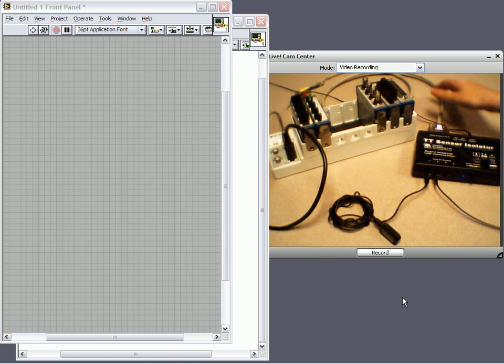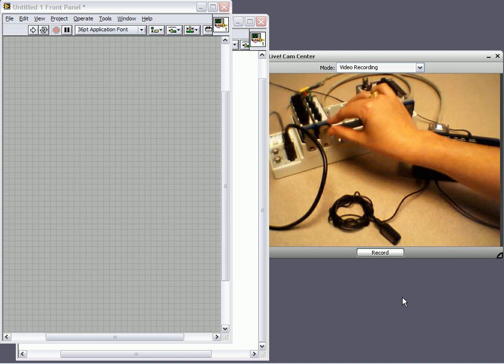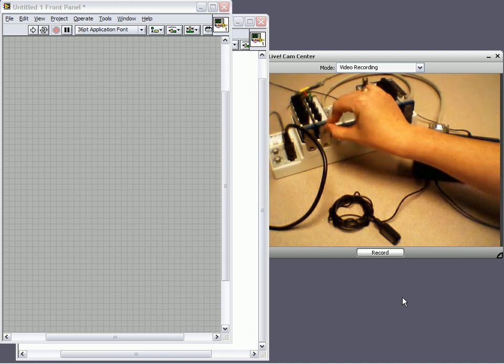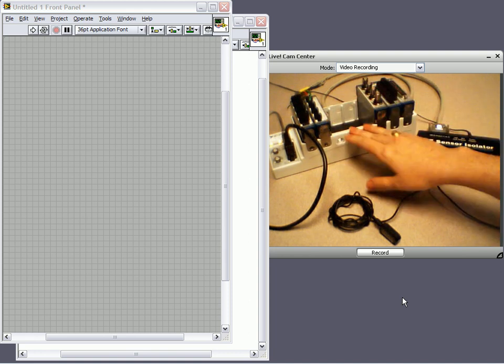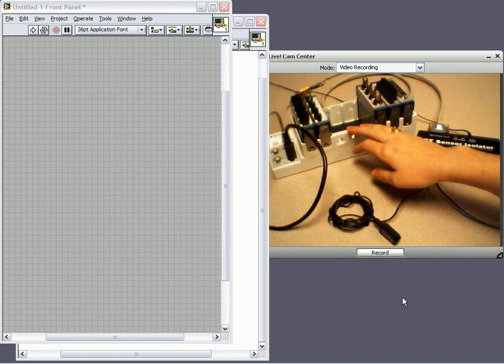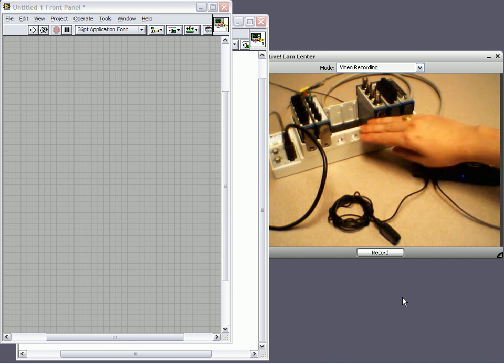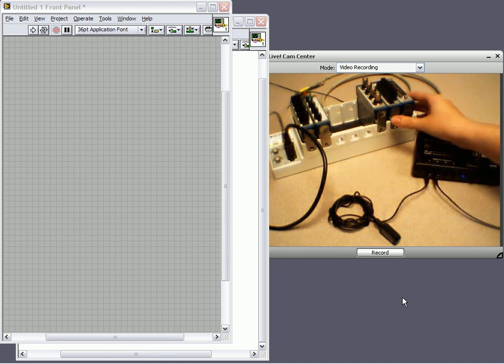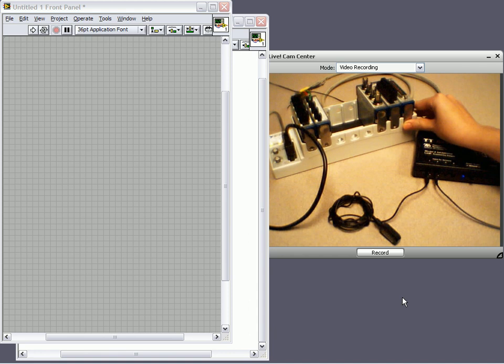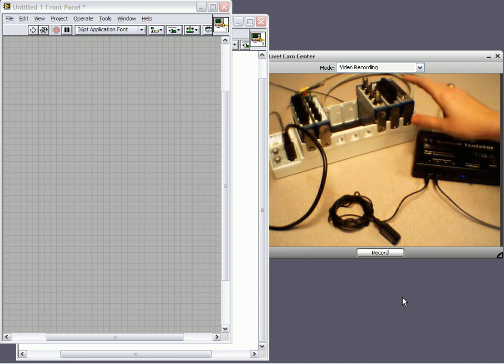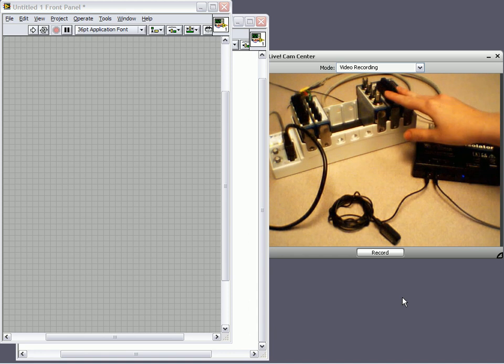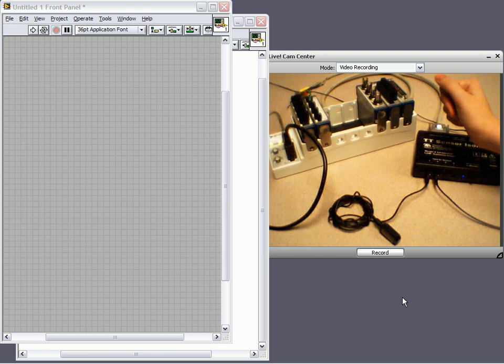We've cabled from the isolator to our 9239 analog input module. Now you'll notice that I've replaced the 9174 4-slot compact DAQ chassis with this, the 9178 8-slot chassis. This allows us to incorporate additional modules to expand the functionality of our system.